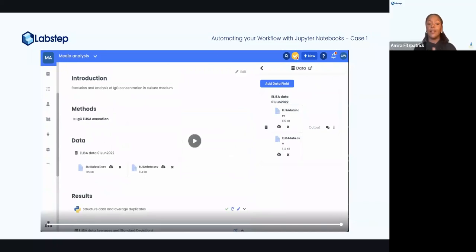Very cool. I mean, I remember when I did my uni project, I spent so much time manipulating the data and getting it from one device to the other. And, you know, it's really interesting to see how the / command works all the way from creating inventory to then linking devices to then this further layer of Jupyter Notebooks to really provide that sort of automated workflow that we're trying to encourage people to use.